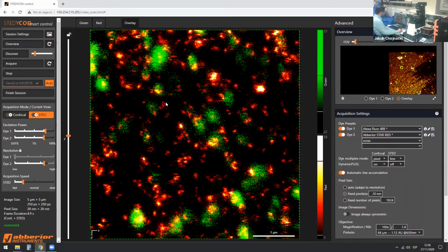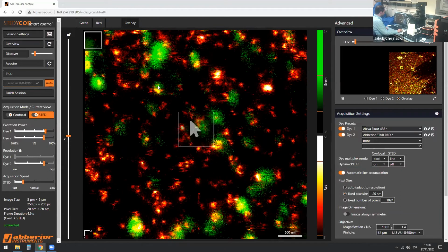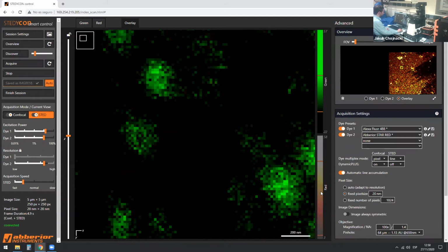What we see, I think, if we zoom in a little bit, I'm going to choose another option. Let me zoom in here. I think what we have here, if I turn the signal on and off, you can see an individual virus particle, and we have a little bit of a signal here. I think there's a very small cluster of these envelope proteins visible here. If I turn the signal on and off, you can see it a little bit better.